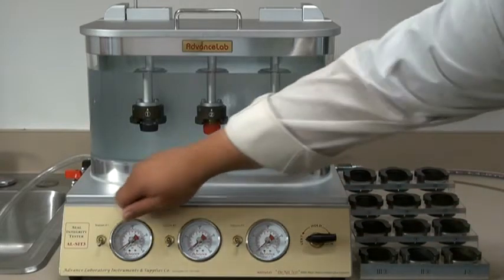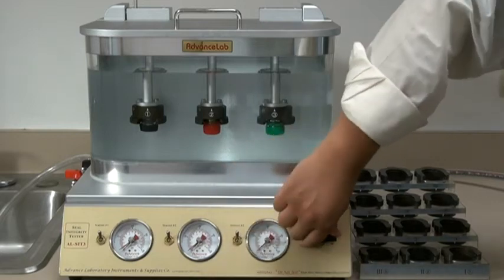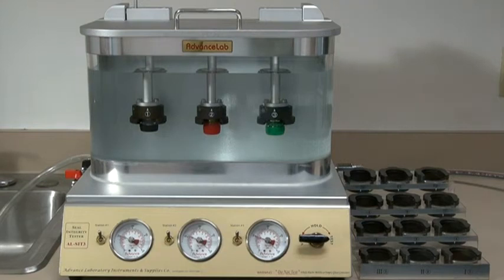This demonstration shows caps with both good and bad seals. All three caps are different sizes due to interchangeable fixtures, which can be customized for your company's needs.